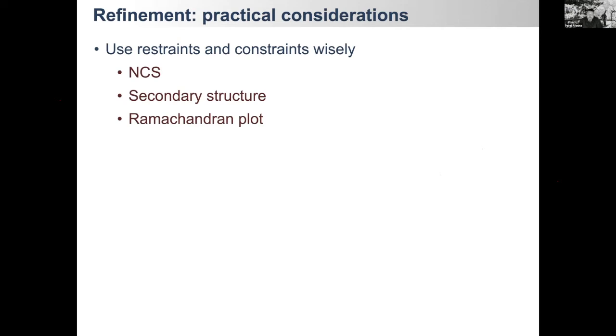And once the map stops telling you about secondary structure geometry, it can go wrong in refinement. That means you need to help refinement by using secondary structure restraints. We're talking about resolutions of 3, 3.5, 4, and similar.